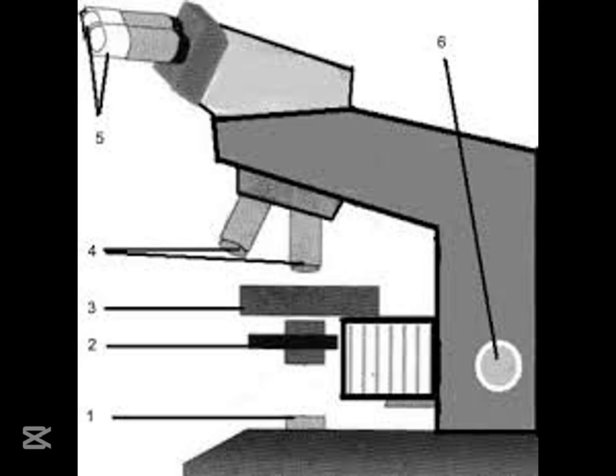Now, look at the microscope from the side and carefully turn the coarse focus knob to bring the stage up. You should see the specimen come into view, probably a bit blurry, though. Once you've got a rough image, switch to the fine focus knob to make it crystal clear.